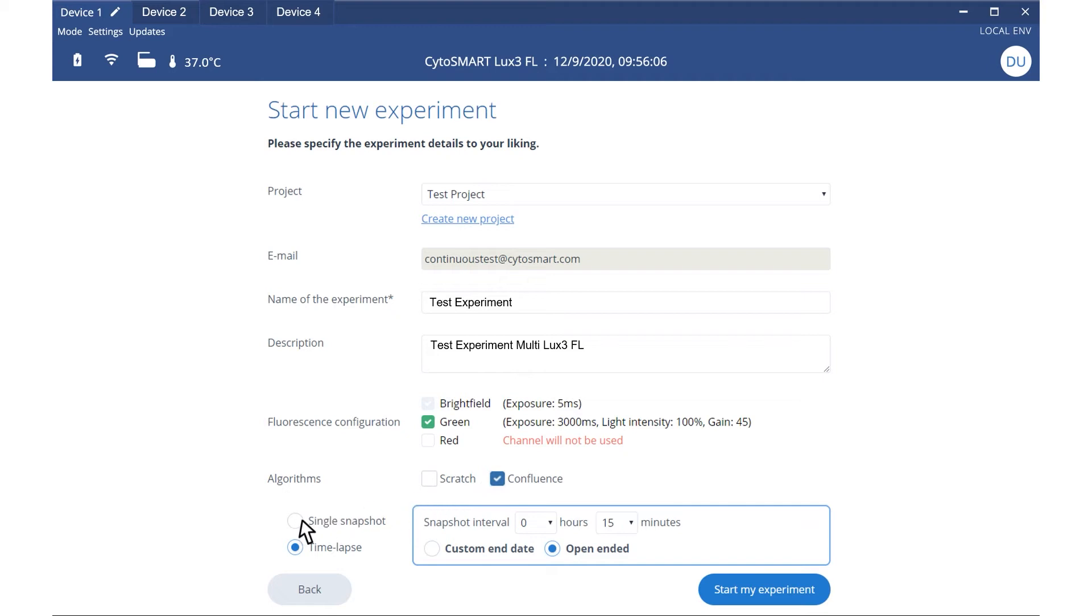Indicate whether you'd like to make a single snapshot or time-lapse. For time-lapse, specify the imaging interval and the endpoint or open-ended imaging. Then you're ready to start your experiment.